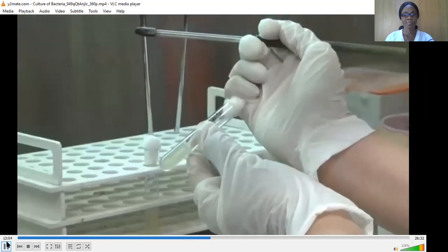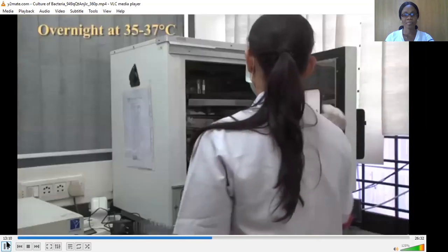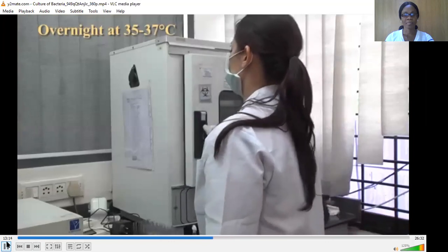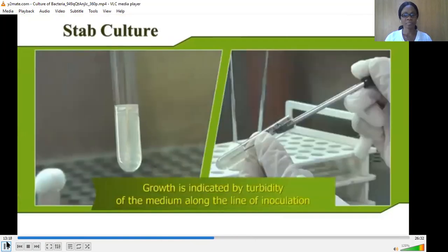Flame the mouth of the slant again and replace the plug or cap. Sterilize the loop after the inoculation. Incubate the agar medium upright at 35 to 37 degrees centigrade overnight. Growth is indicated by turbidity of the medium along the line of inoculation.